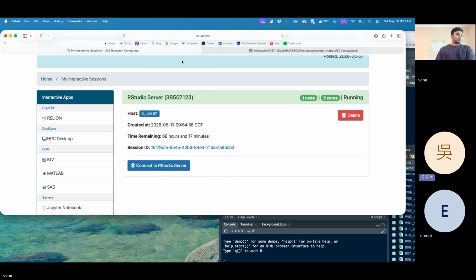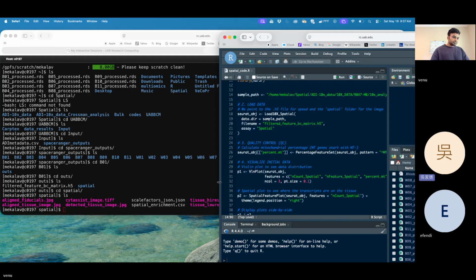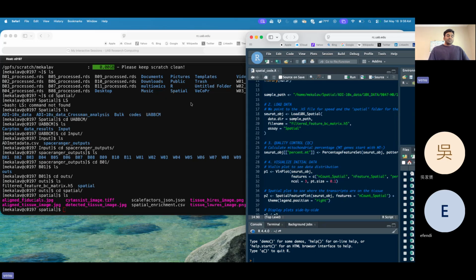For a real case study, it can be achieved using your notebook. You don't need high-end GPU computing resources, do you? My PC has 48 GB, like a Mac. For 10 samples, I don't think we need a big memory.